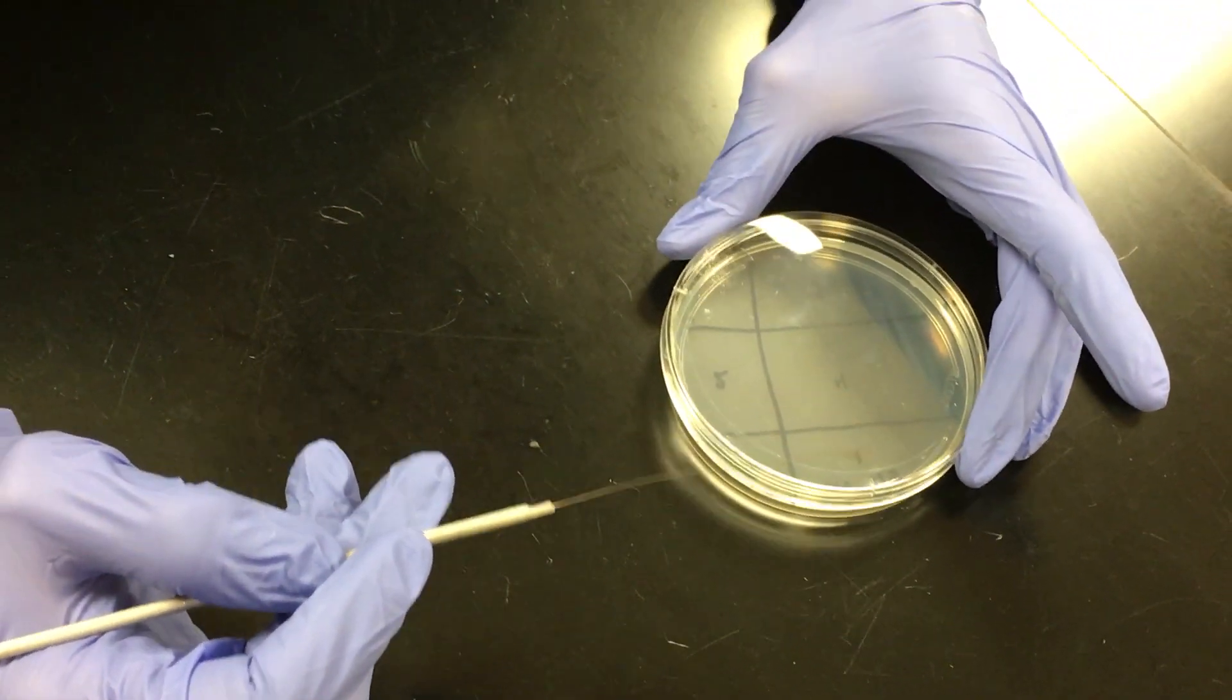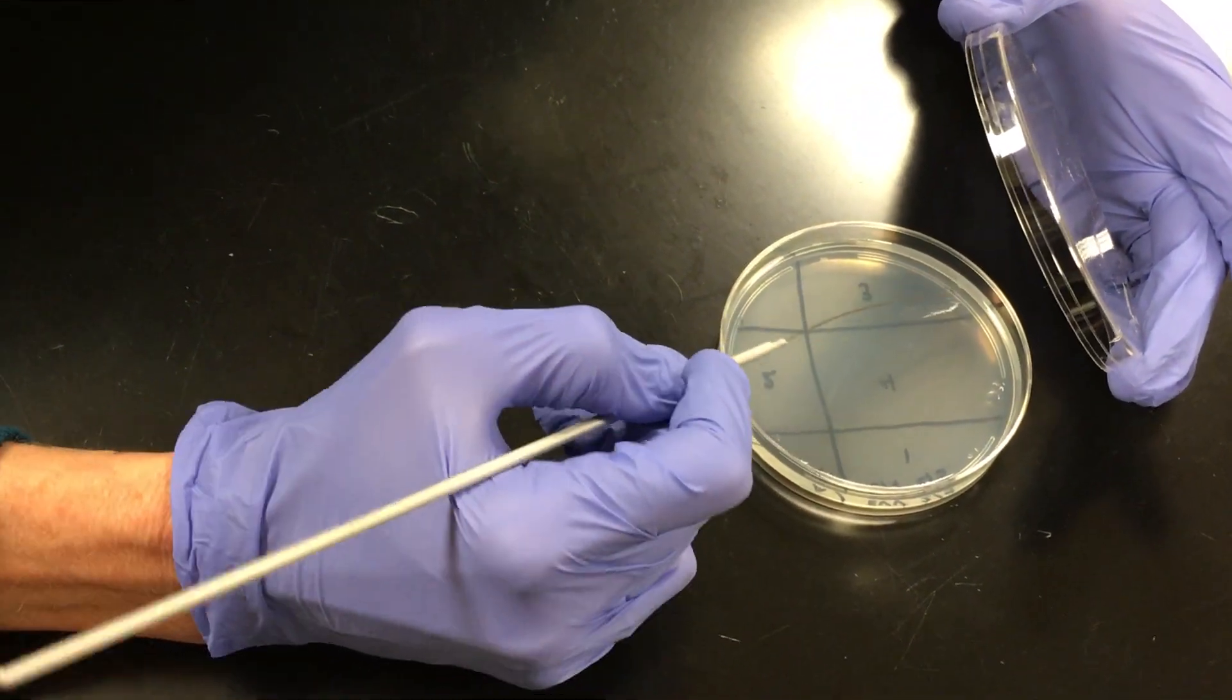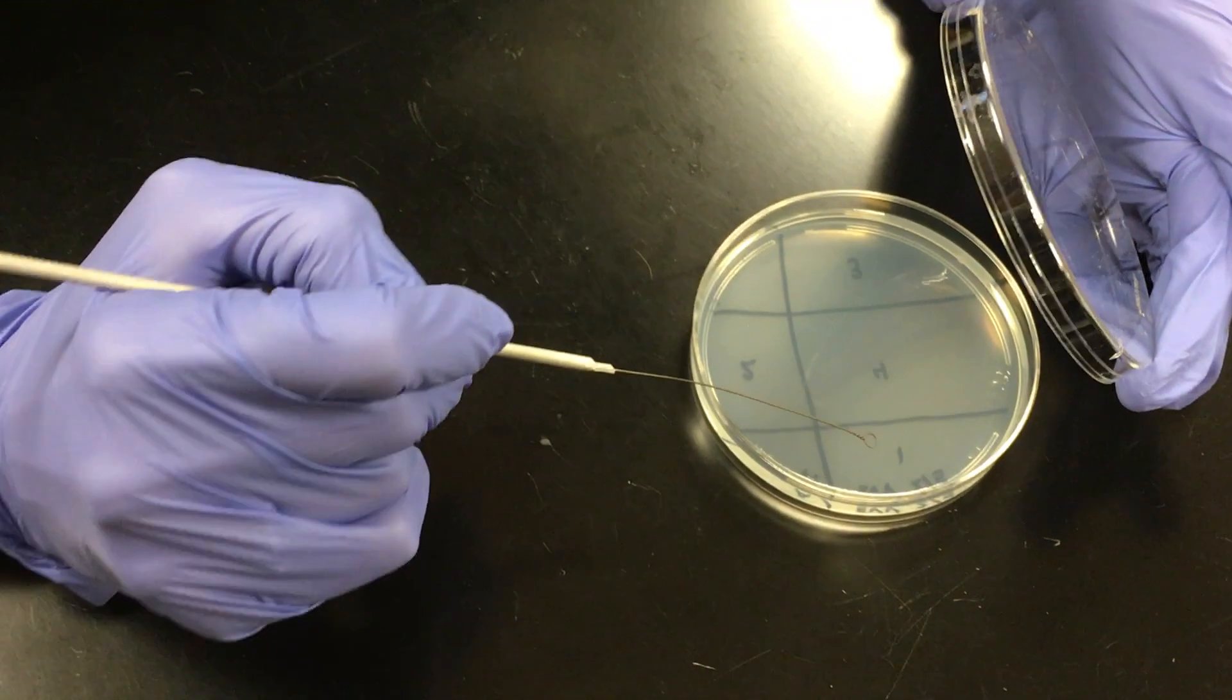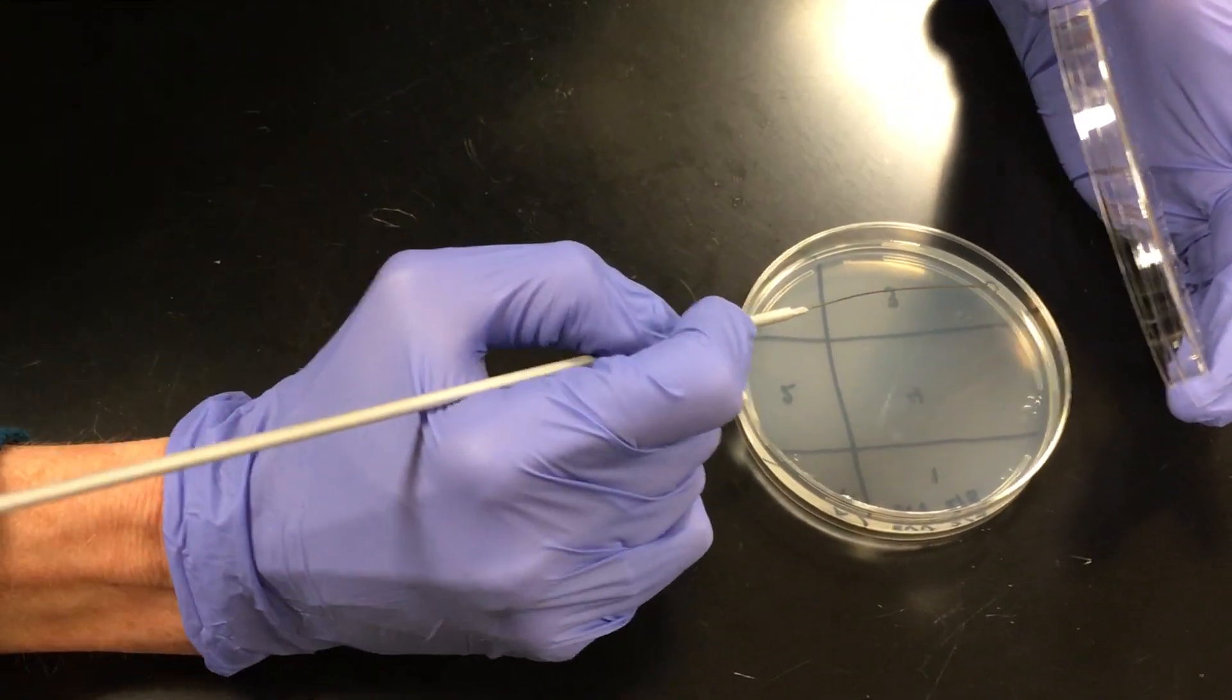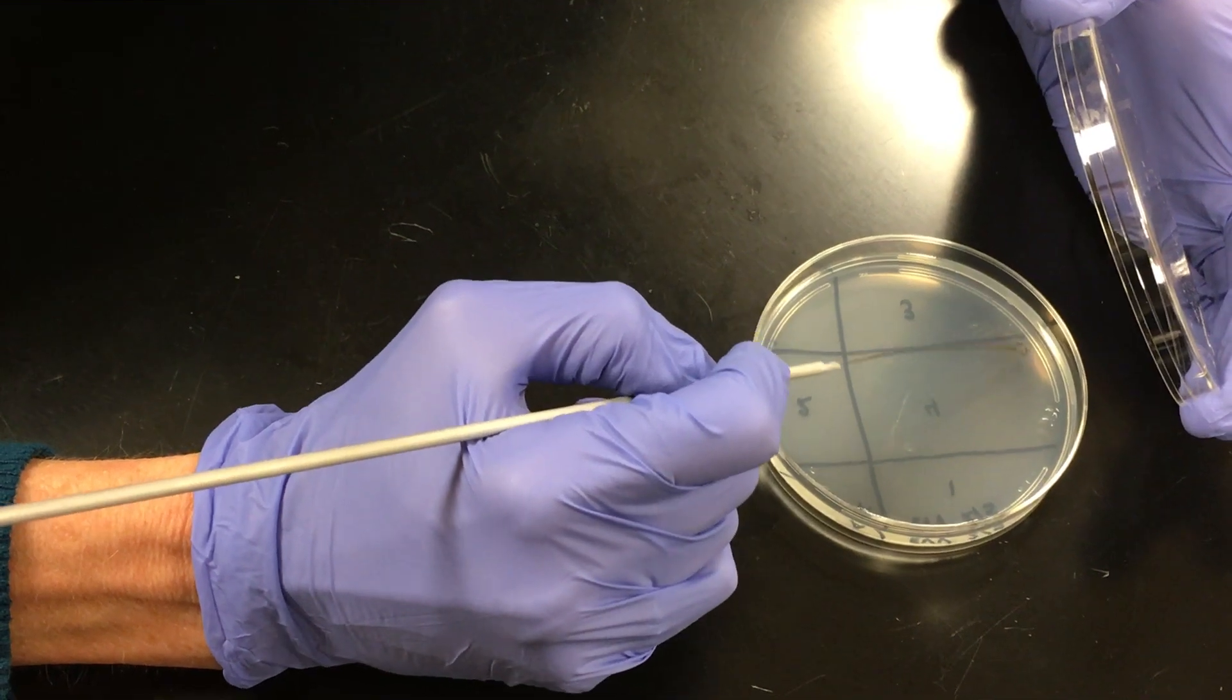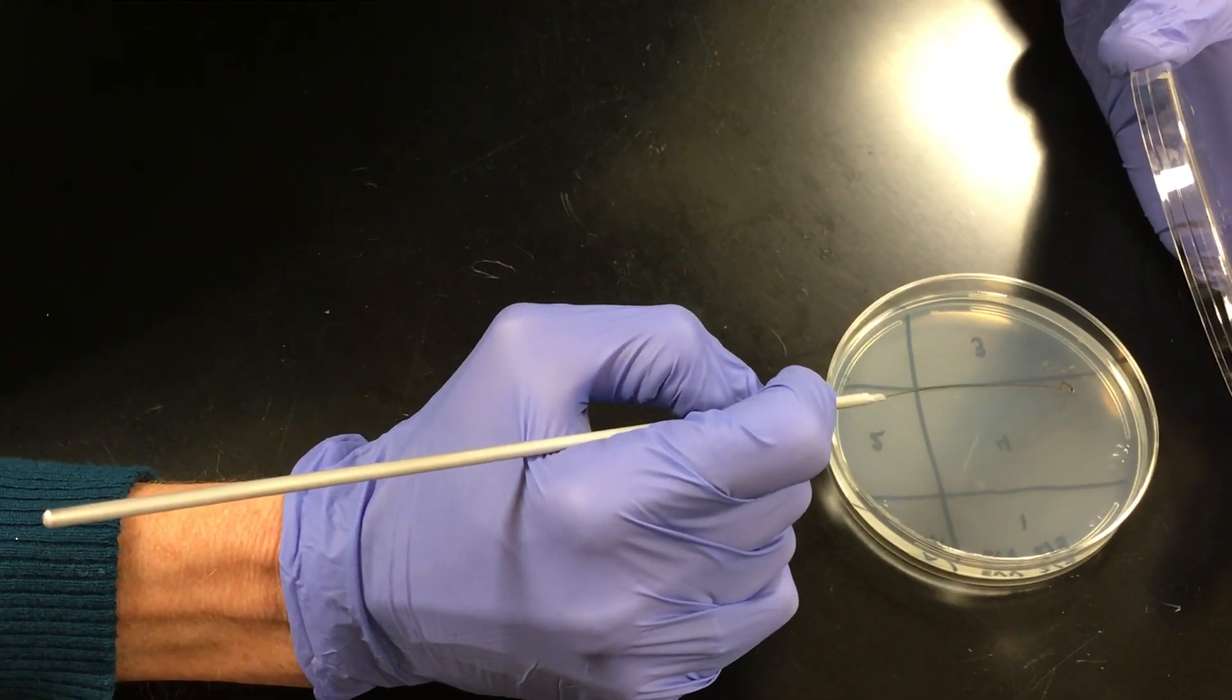So now this quadrant four is the money quadrant. It's going to be a little bit different. I'm only going to go into quadrant three two times. So, oh, got a sizzle. We don't want to burn our bacterium. Sizzle. Okay. So one, two, and now I'm not going to go back into three.